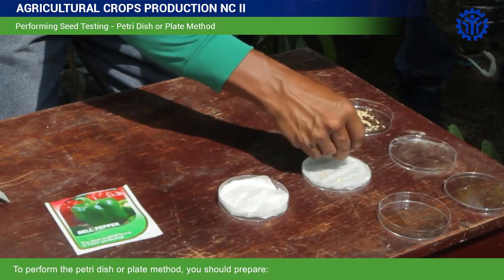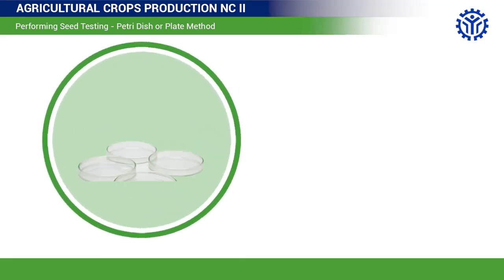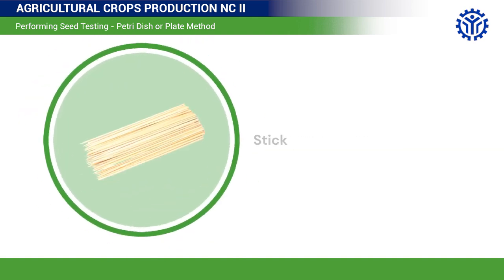To perform the Petri dish or plate method, you should prepare: a marker, two Petri dishes with covers, filter paper or tissue, any type of seeds, a sprayer, and a stick.